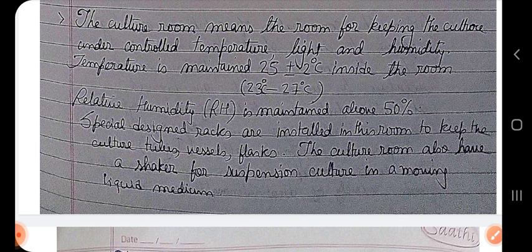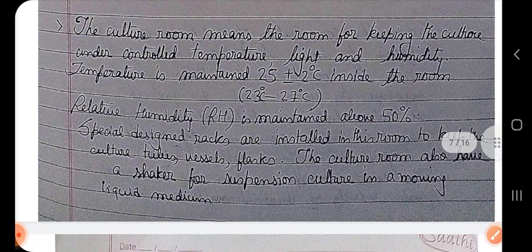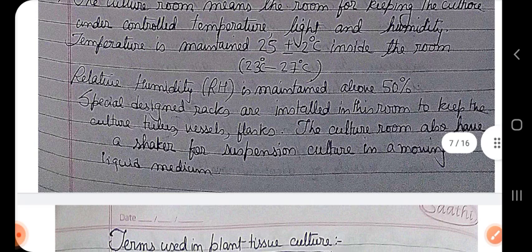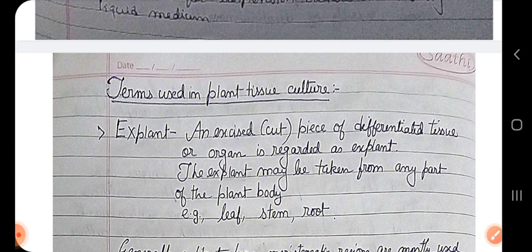Now, if the cells are grown in liquid medium, they have to be rotated, otherwise they will settle down and they will not get enough nutrients. For getting proper nutrients, they have to be properly aerated, properly agitated. And for agitation, we need a shaker for the suspension culture, so that the cells can get an equal amount of nutrients, so that they can grow into callus, and from that callus we can place them in a semi solid medium for the growth of the plantlets. Now there are some terms that have to be used in plant tissue culture.